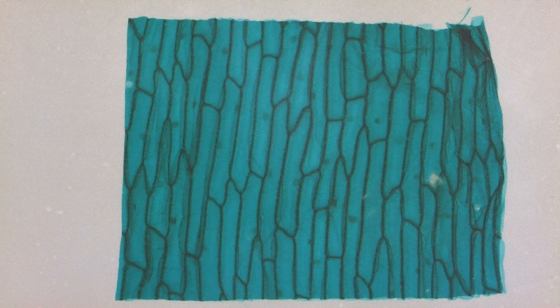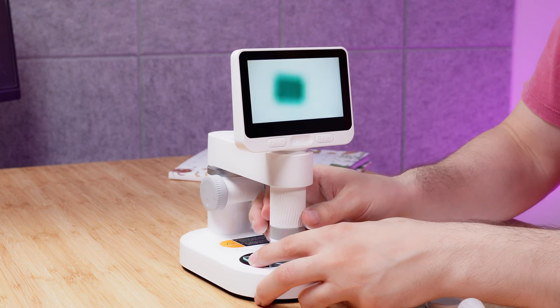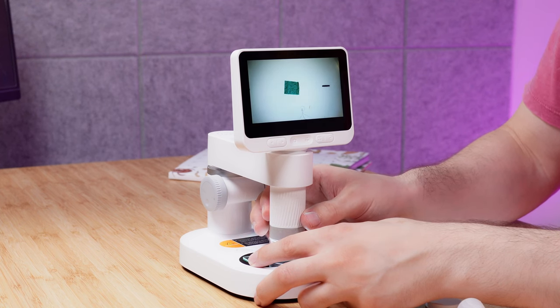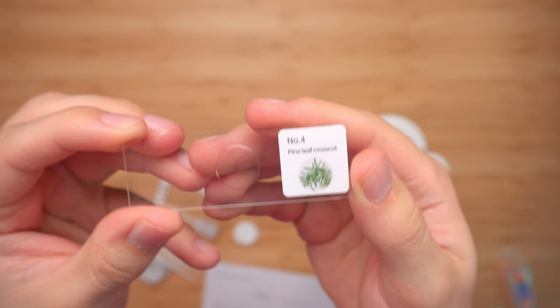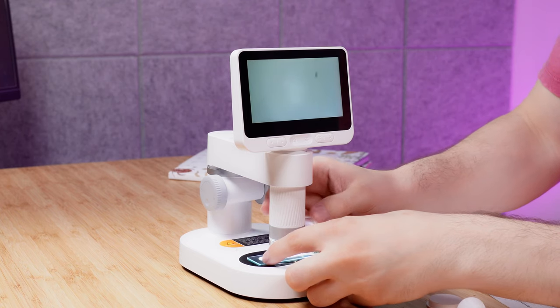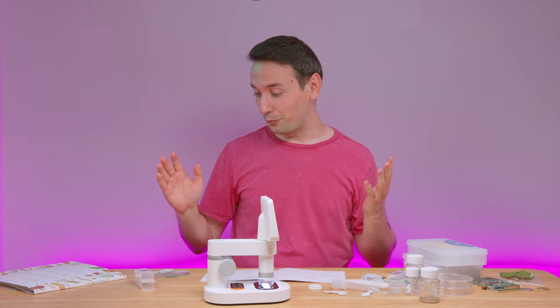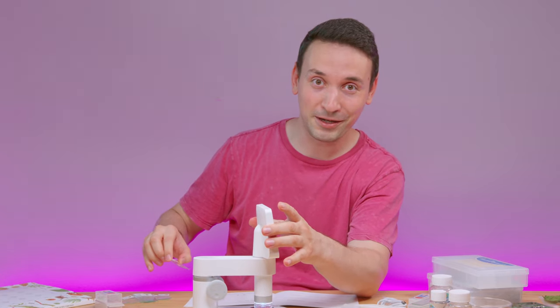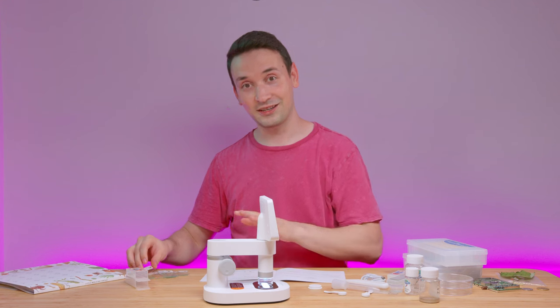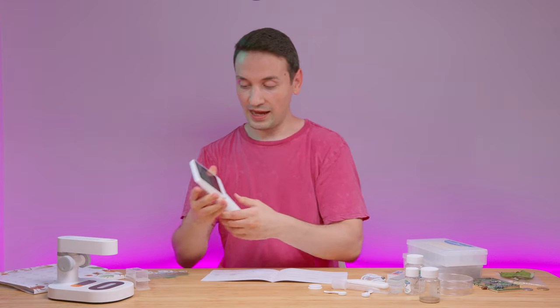Here's the onion skin — this one looks very interesting. I would have never thought onion skin would look like this; look at all that detail. And this is the last one: a pine leaf cross-cut. For someone who doesn't really know microscopes, I'm really happy they included all these specimens so I can see the potential of this microscope. That's a really great add-on.